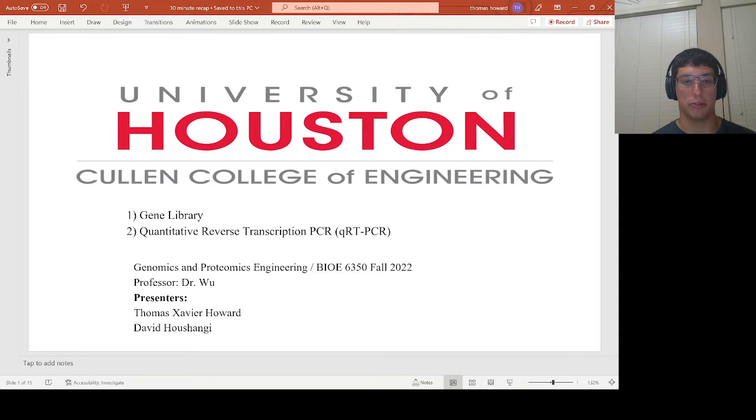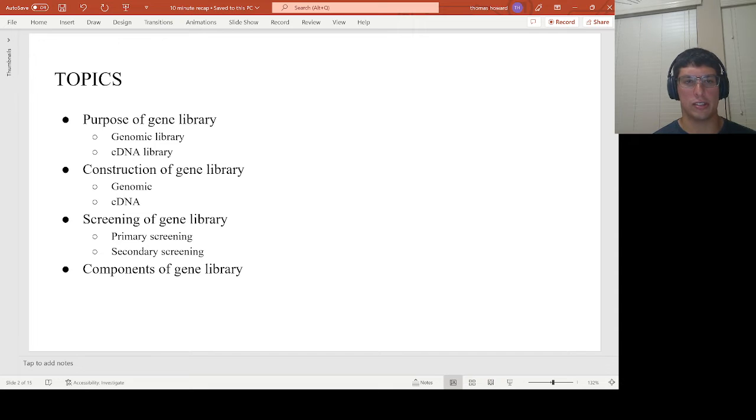Today in this 10-minute recap we'll be covering the gene library and quantitative reverse transcription PCR. I'll start out this presentation by covering the gene library, and I'll cover it as the purpose, construction, screening, and components of the library.